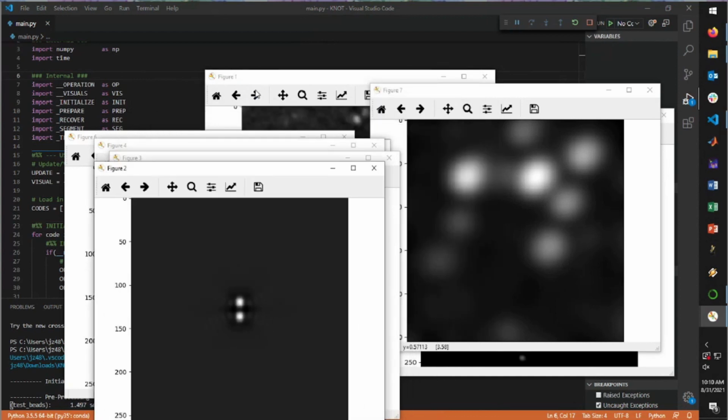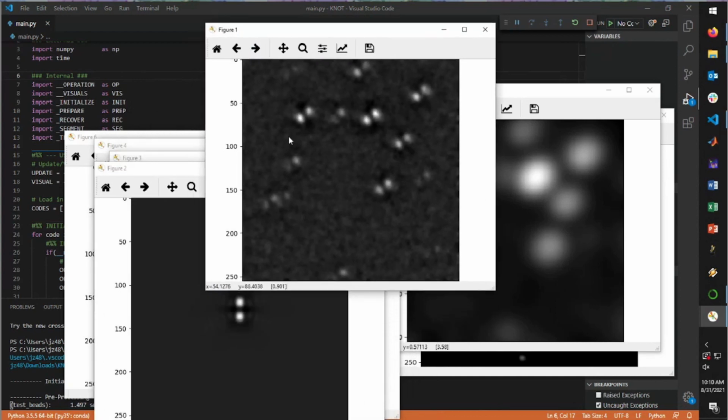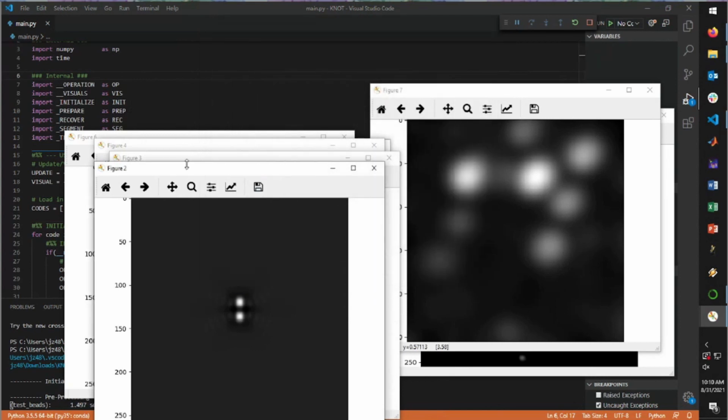Let us look at figure 1 once again. This here is the pre-processed image with background subtraction and noise suppression. Figures 2 through 6 are samples of the pre-processed phase mask. There shouldn't be much difference between these and the samples we've previously seen. Nonetheless, this is your last chance to make sure that the PSF aligns before deconvolution.